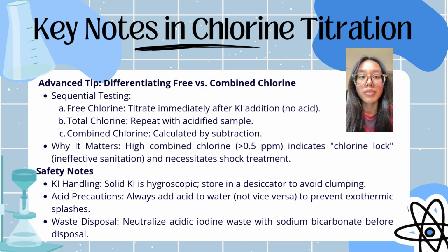Safety notes. First, KI handling. Solid KI is hygroscopic and should be stored in a desiccator to avoid clumping and inaccurate measurements. Second, acid precautions. Always add acid to water, not water to acid, to prevent violent reactions and splashes. This follows standard lab safety rules to manage exothermic, which is heat-releasing, reactions.